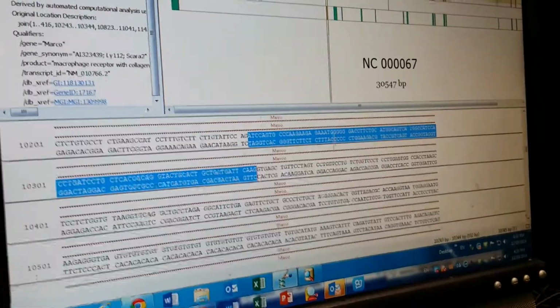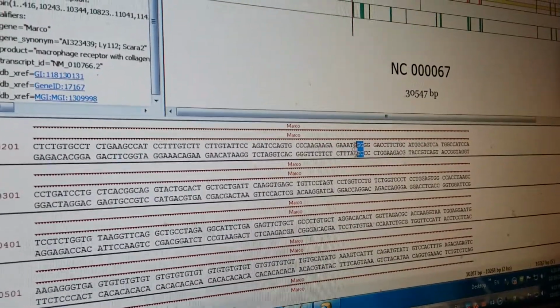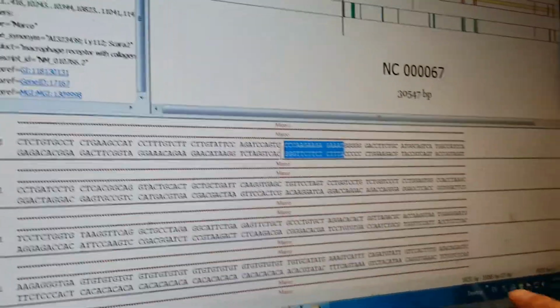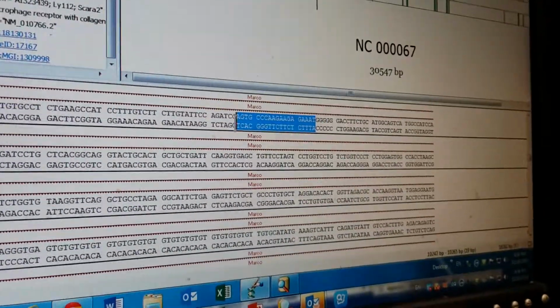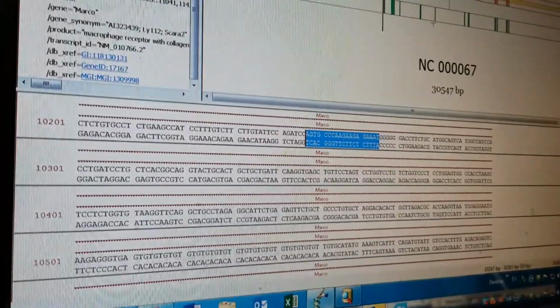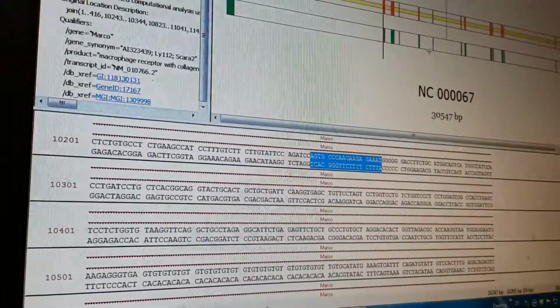Okay, we can find GG. Just look at GG, and this is 3G. Okay, GG, 19 base pairs before this is a G. How are you counting? Here, oh, I see, down there. Yeah, very easy. It's not a G, so I think it's a G on the other strand. You just focus on the top. Oh, it has to be G on the same strand. Yeah, on the same strand. Let me double check how many base pairs are needed.